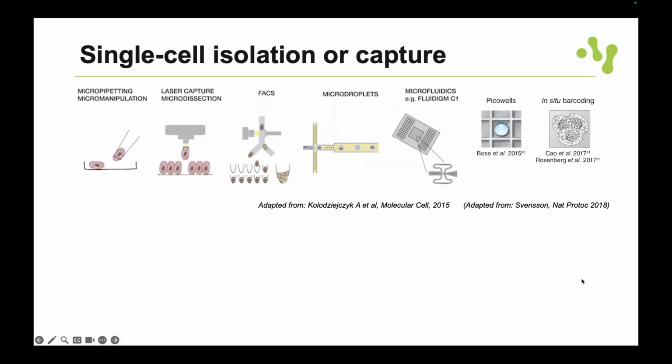In common between these, this is an even older slide I started off with, it can sometimes still be that you manually pipette. Nowadays it is because you first want to measure on these cells with electrophysiology, then it's called Patch-seq. So you can measure the electrophysiological properties, and later also see the gene expression. So it's still sometimes used in some niche projects.